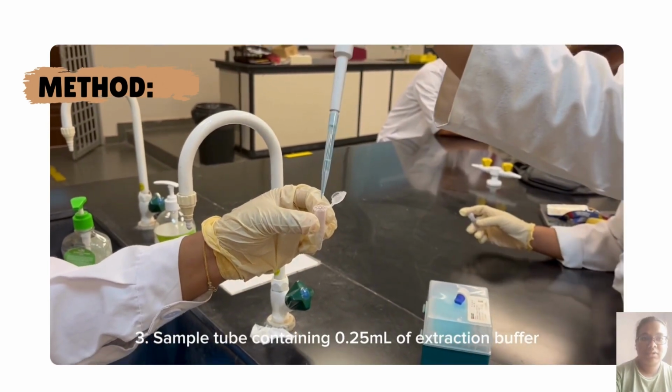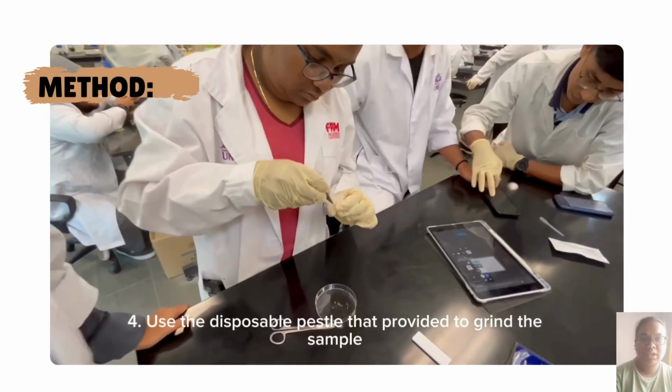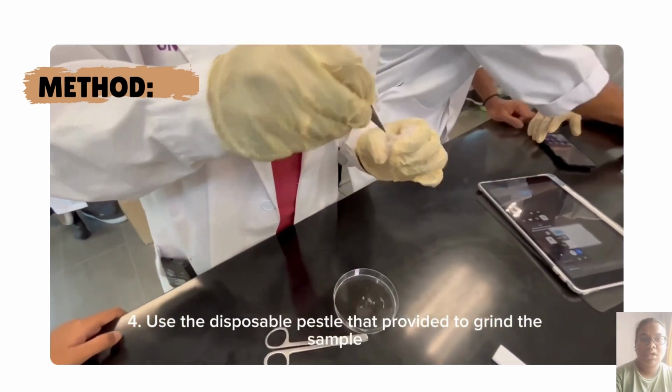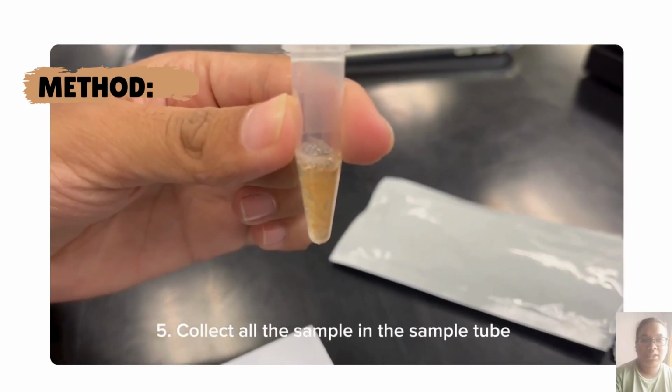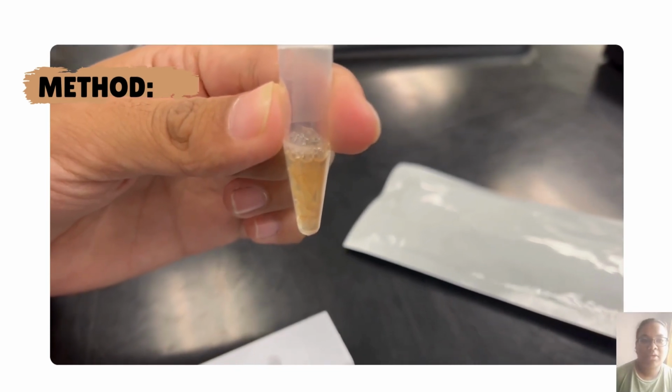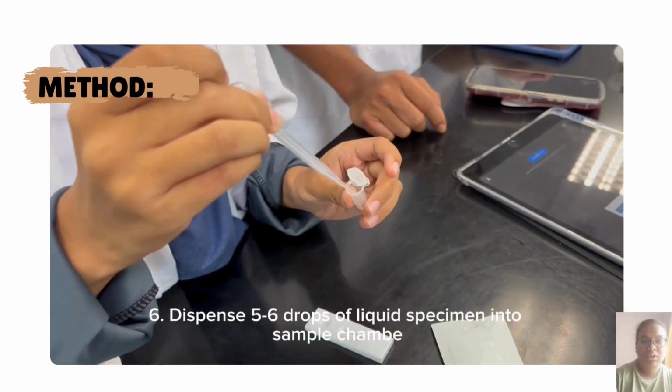apply and mix the shrimp sample. Using the test kit, apply a few drops of the shrimp sample to the kit.